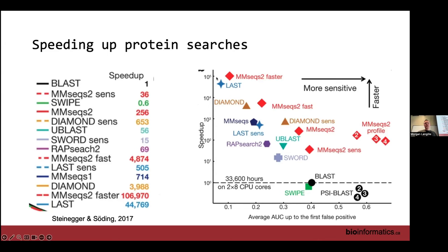So the problem with this, as I alluded to, is that just because we've found a gene, and that gene is sometimes mapped to multiple types of modules or pathways, it doesn't necessarily mean that all those pathways exist. So if you start to count them up across a community, how do you decide what pathways are there or not?